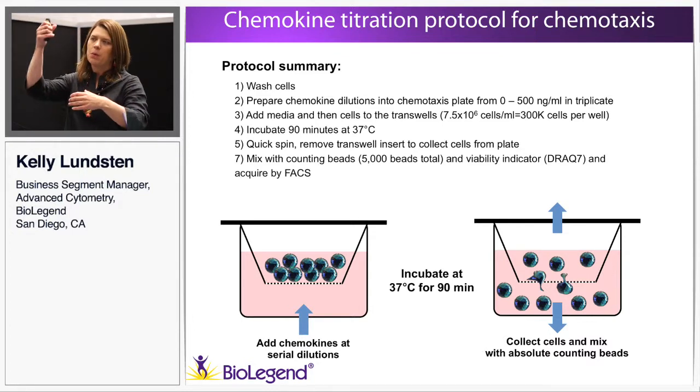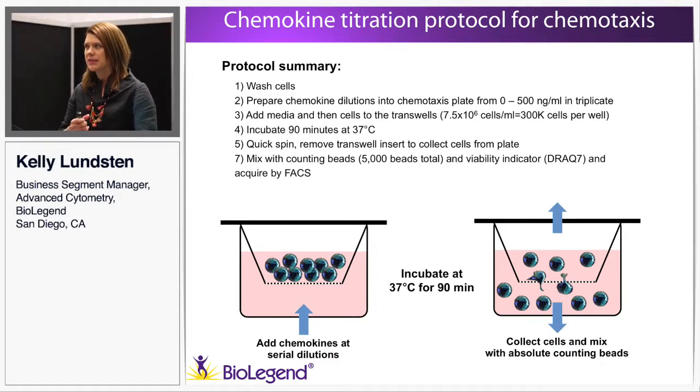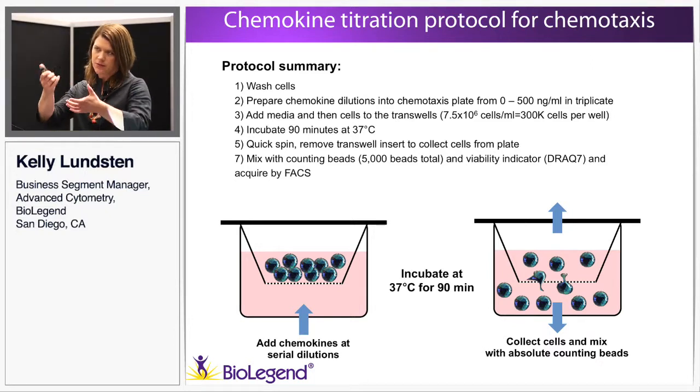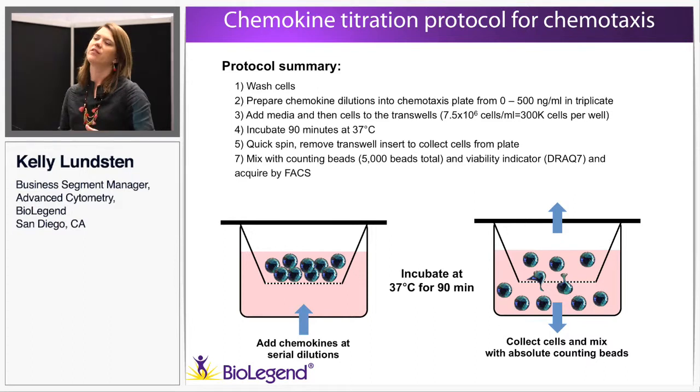And I think what's most important to understand, especially because it introduces a little bit of variability in the assay, is that before you do a cell count, it's an absolute cell count. So you're spiking in about 5,000 beads to do an absolute cell count, so that no matter what the volume is, no matter how diluted those cells are, there's still 5,000 beads in that. And that's what you're relating to the total capture of events. So I would capture about maybe 1,500 bead events and then relate that to how many cells I captured during the same period of time.